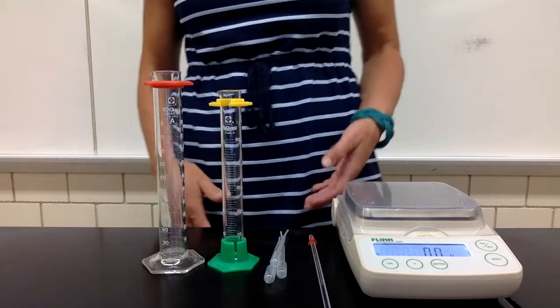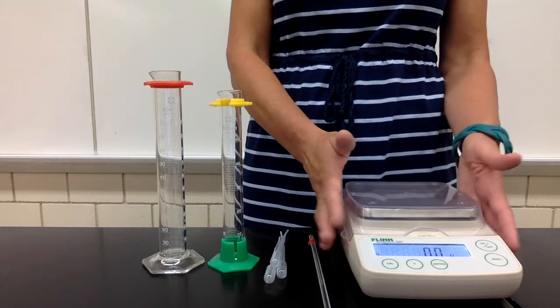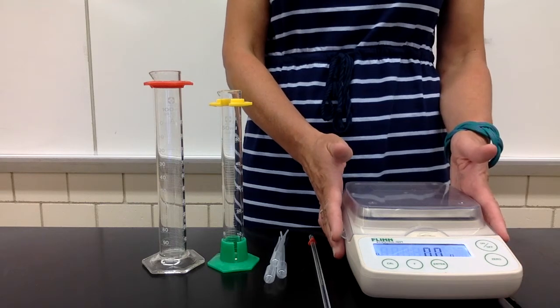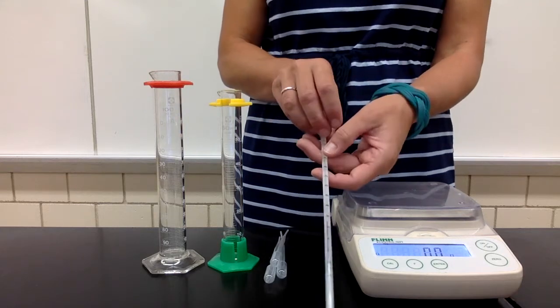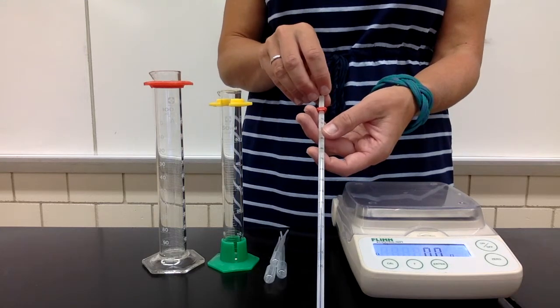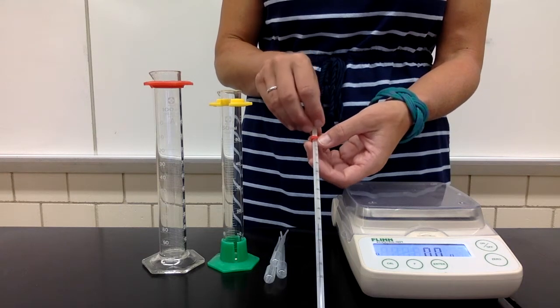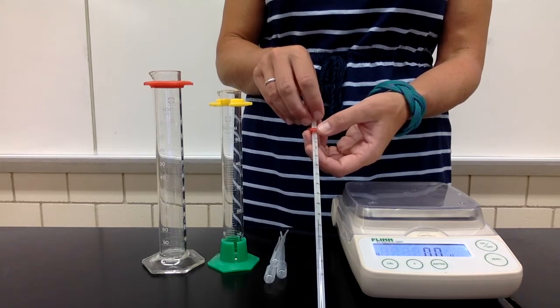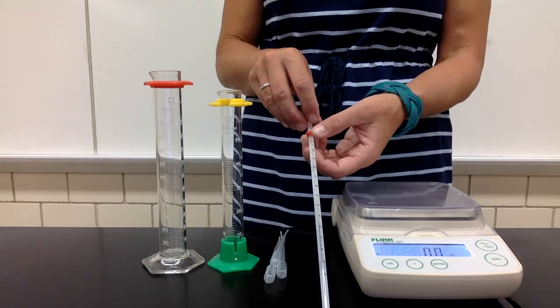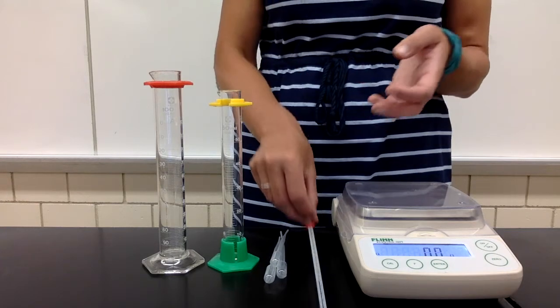I want to introduce you to the equipment before we start. So right here we have an electronic balance that will measure the mass to the nearest tenth of a gram. And then we have a regular thermometer that measures temperature in degrees Celsius. Each line is a tenth of a degree. We can measure to the hundredth of a degree, but we don't really need to be that precise for this lab, so we'll measure to the tenth of a degree.